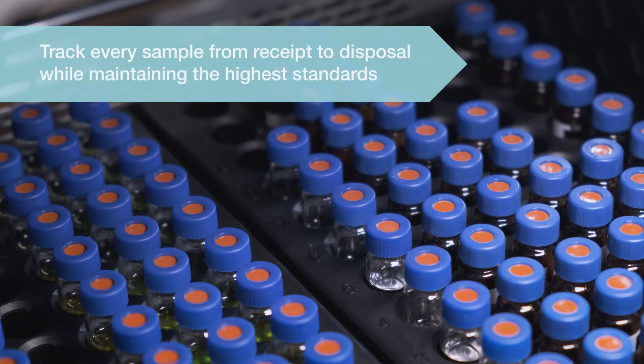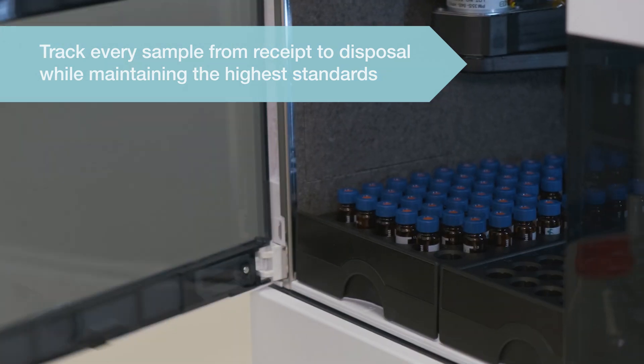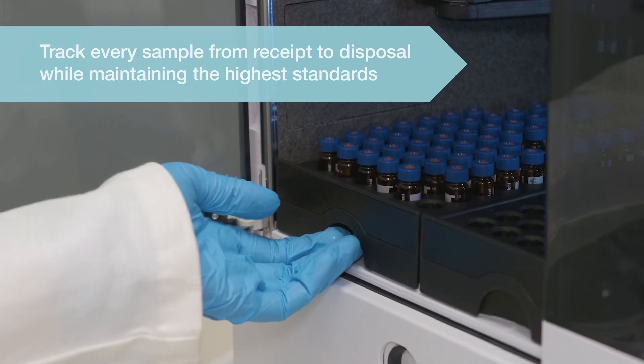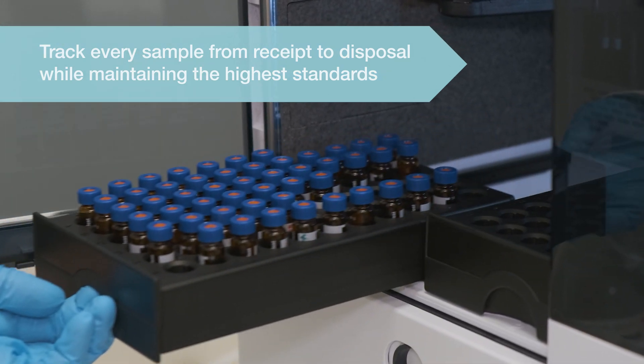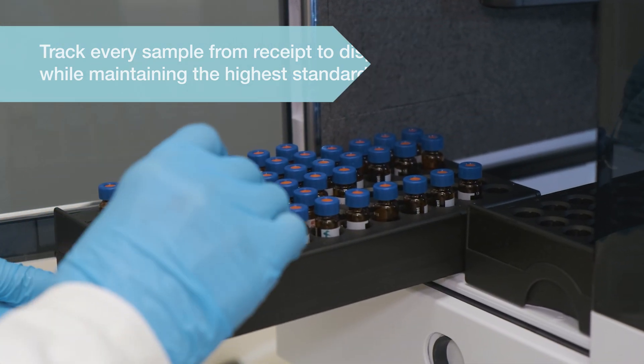Allowing you to track every sample from receipt to disposal while maintaining the highest standards.